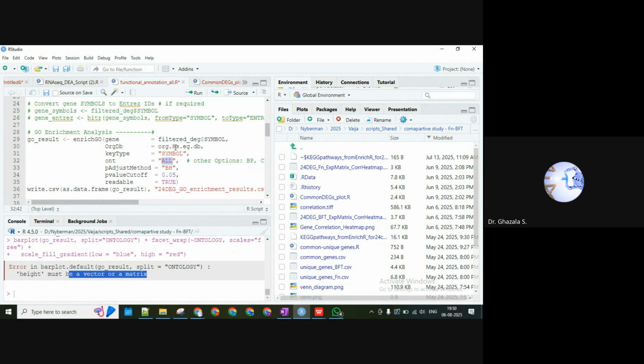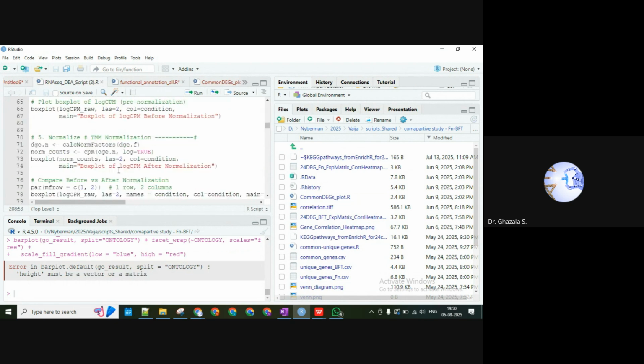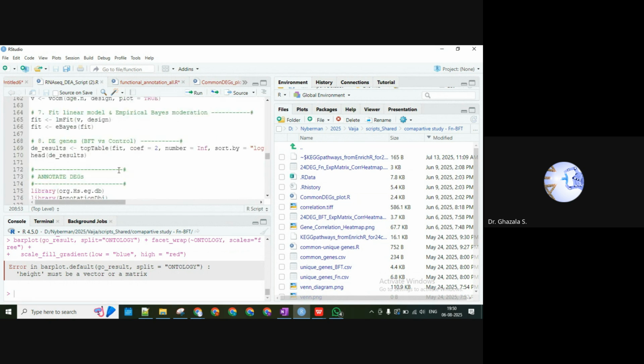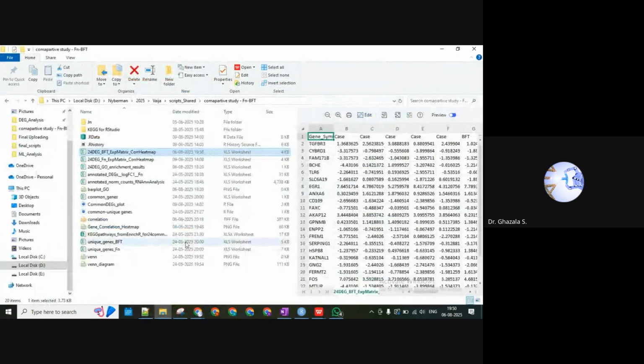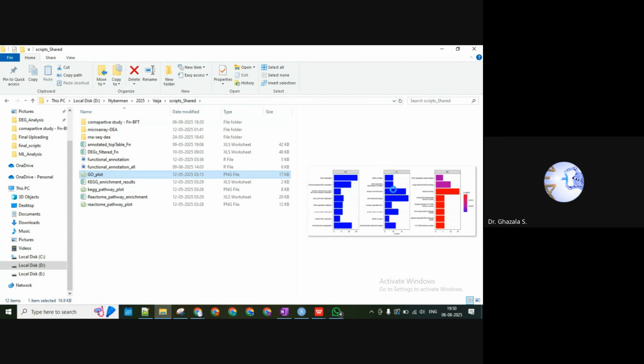What I'm saying is, this script I have shared, you can generate the figures, as we have already generated figures during the analysis, I guess. I think in the analysis we generate the figures, right? I already have those figures which we generated for KEGG pathways and all the stuff. These are figures like the GO plot. You have that in the PPT, right?